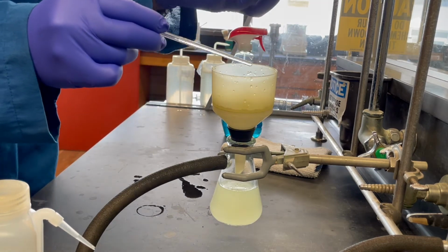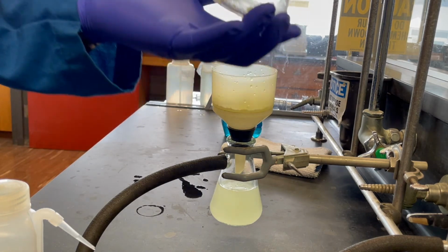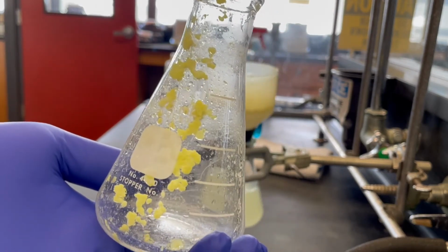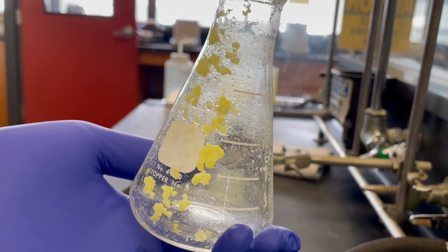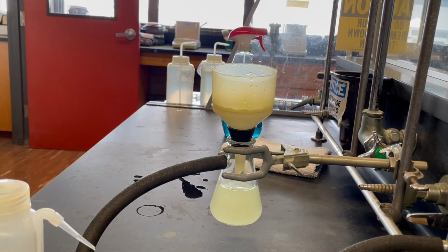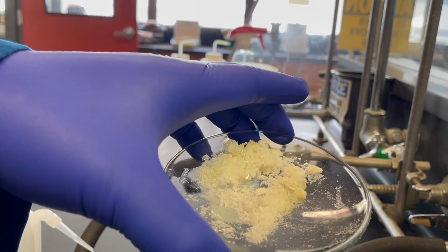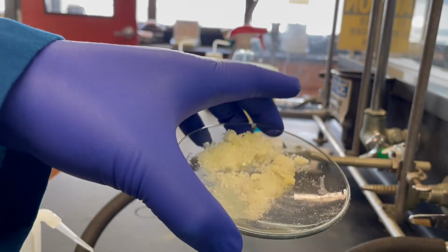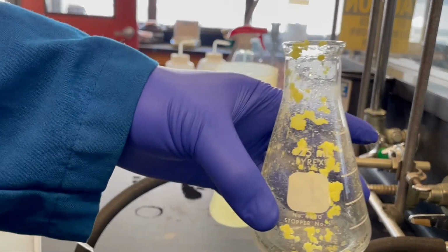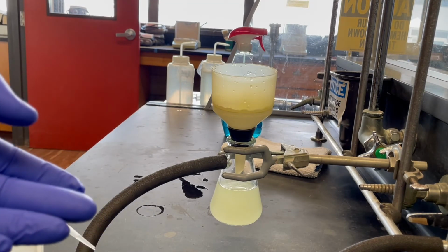Basically, you can see that it's a nice yellow solid though, so that's cool. It's different than what we had. Oh, maybe you can't see. Yellow solid, right? Different than what we had. Just a little comparison. We had this stuff right here. It is a little yellow, mostly white though. It's actually more white in my lighting than it is on the camera. But that's clearly yellow. So it's different. We'll see what the melting point and IR look like.